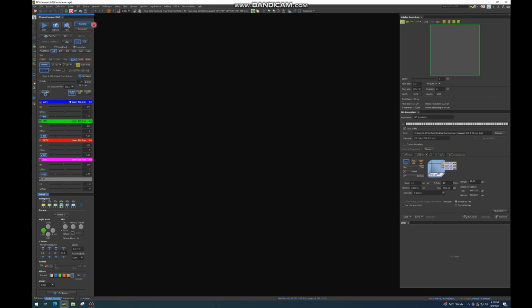Here we have two types of scanning. We have Galvano and resonance scanning. Galvano is a high resolution scanning, and resonant is low resolution, high speed scanning. With Galvano, although it is slower speed, it provides higher resolution, and this is what most people in our department use. AG is for auto gain, and here we get into the direction of the scan. You can do unidirectional scan or bidirectional scan. Most people have it on unidirectional scan. So here we get on to the speed and the size of the image.